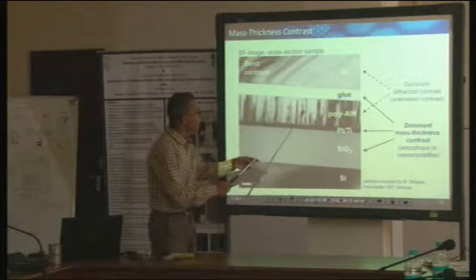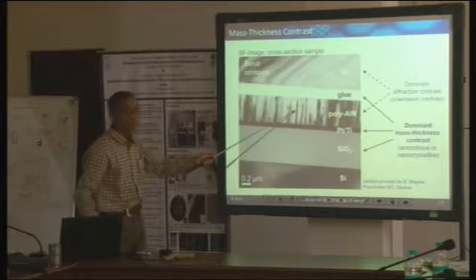Now you see this. Here we see contrast, and that contrast is actually due to diffraction contrast, because this particular columnar grain was differently oriented in comparison to this dark one. Their diffraction conditions are different. This one is not diffracting, in the case of bright field.